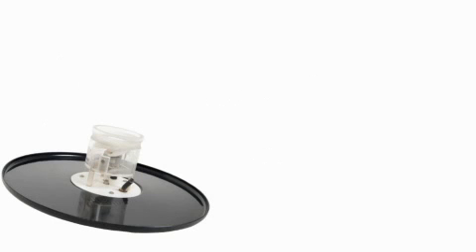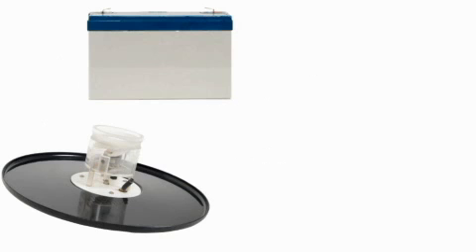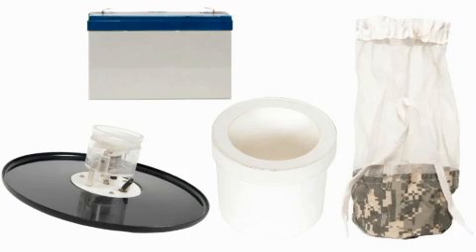The components necessary for the light trap are the trap body with attached rain guard, a 6-volt battery, a collection container, and a collection bag.